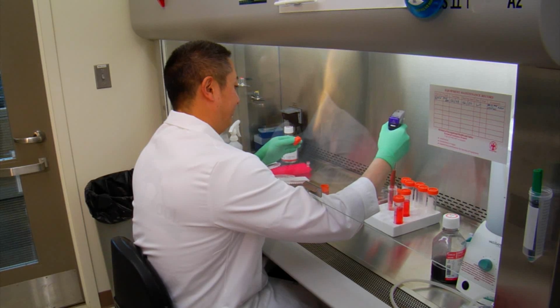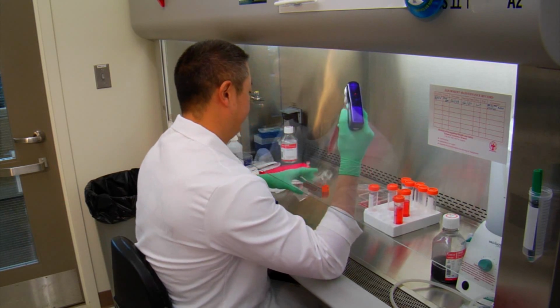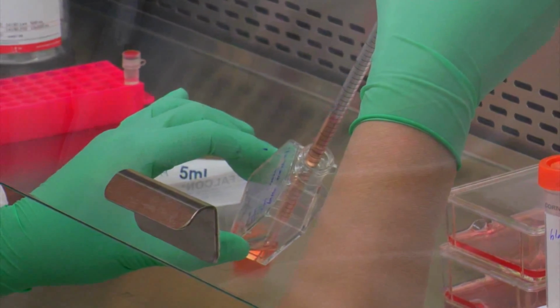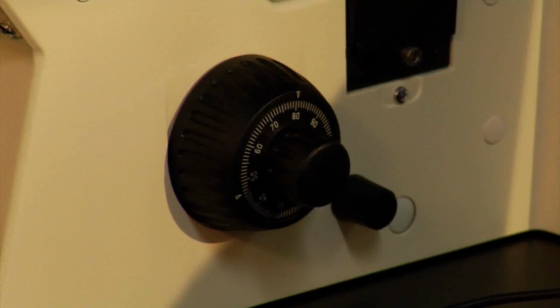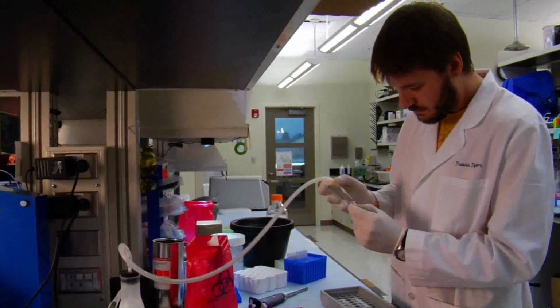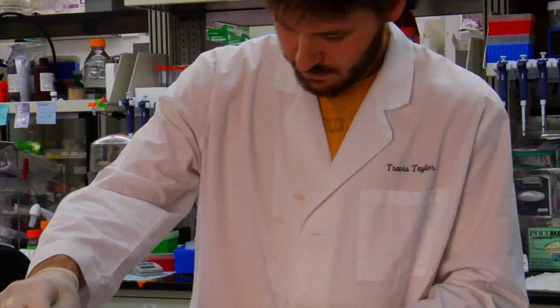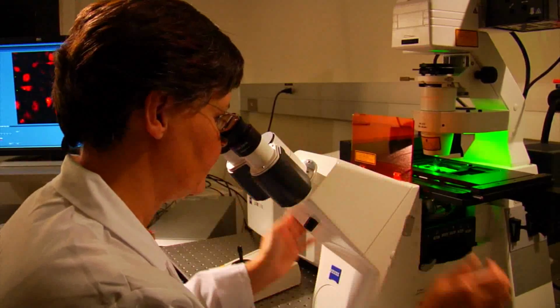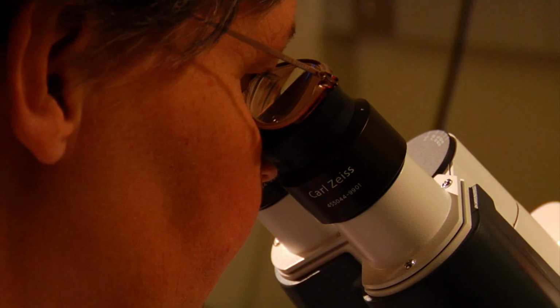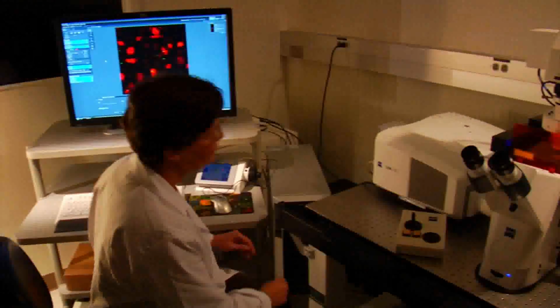These new facilities have really provided us a wonderful opportunity to make sure that we are at the top of our research capacity and be able to be responsive in the event of an emerging infectious disease or if someone deliberately tries to introduce a very dangerous agent into the public domain. We're applying the basic concepts here of research to understand how viruses cause disease and why they are so virulent, using animal models and classical virology combined with modern molecular technology. And I think in that way, I feel IRF is a bit unique.